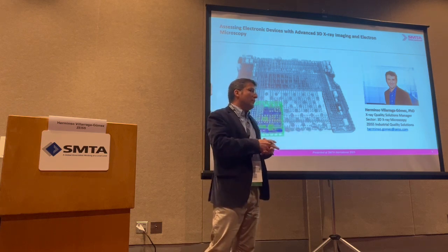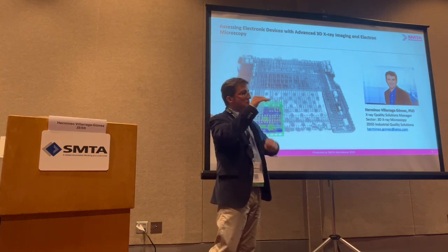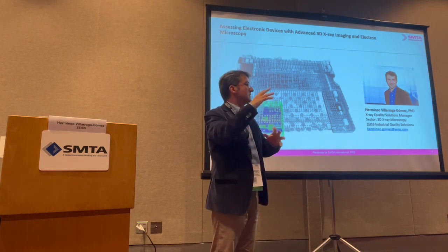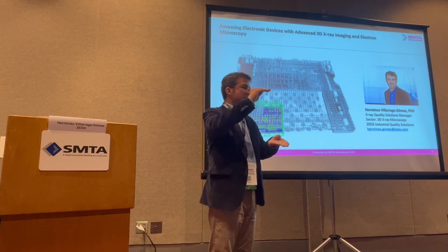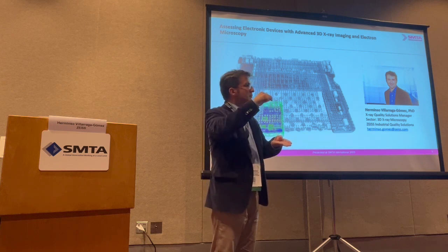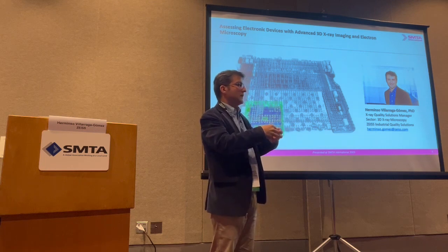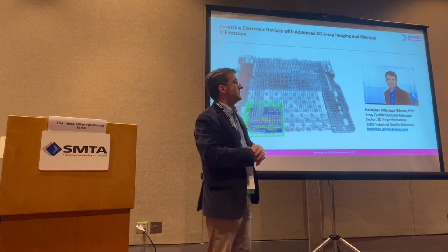What people have done is to use in situ stages to do testing. For example, a compression test is an easy one because you can put certain compression, scan, then increase the compression, scan, and then you have the evolution in time. There are other packages for in situ testing in materials that can be done.